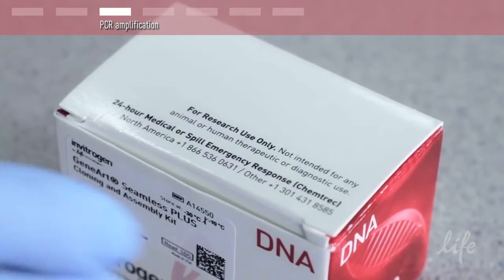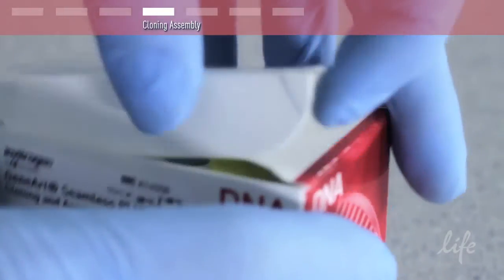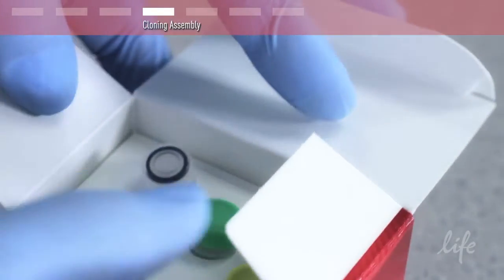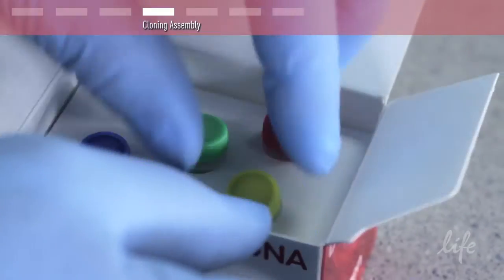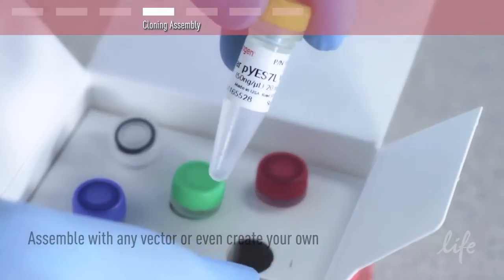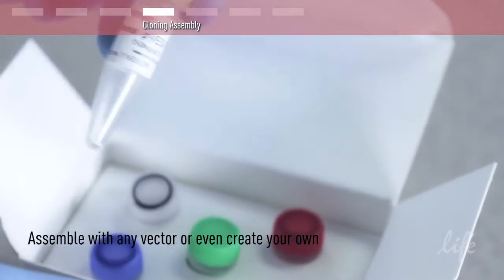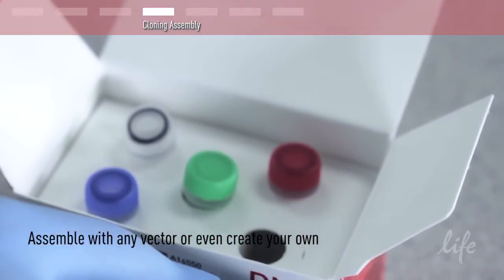Now you're ready to use the GeneArt Seamless Plus cloning and assembly kit. Depending on the size of your construct, take the appropriate linear vector from the kit. This kit does however allow assembly of any vector or creation of your own.